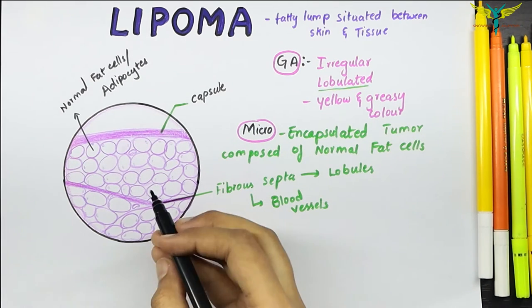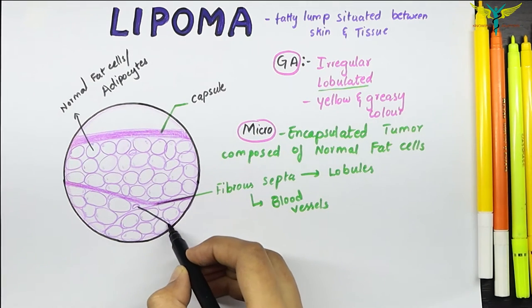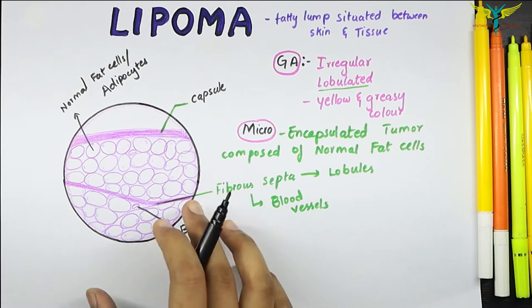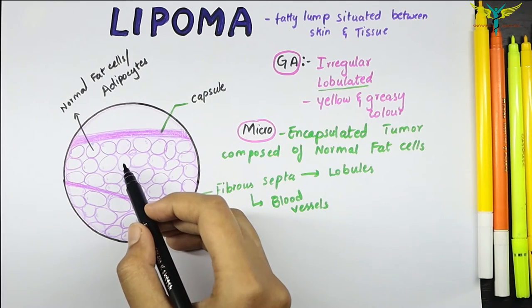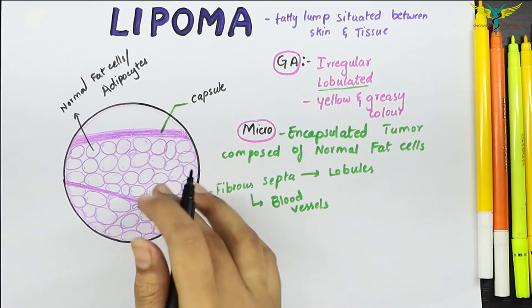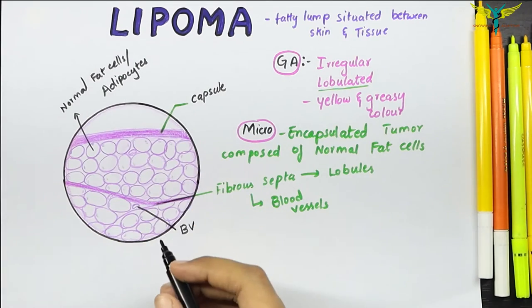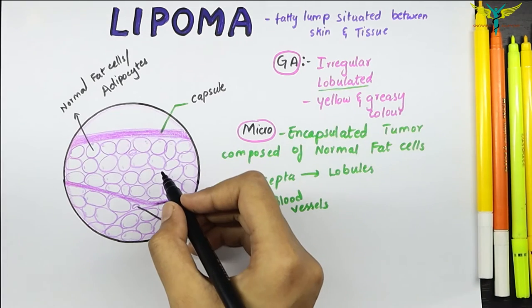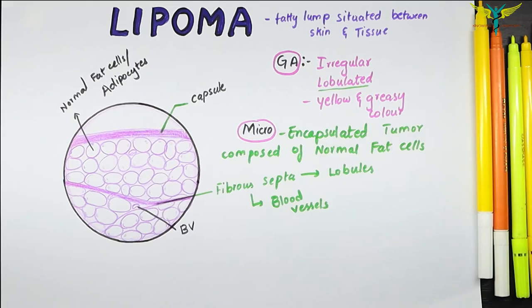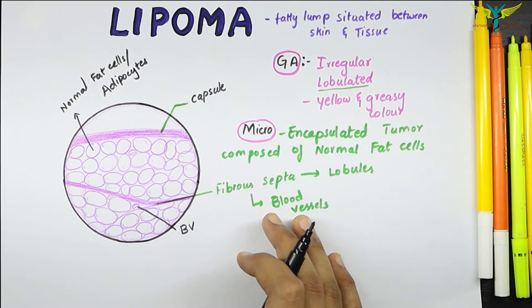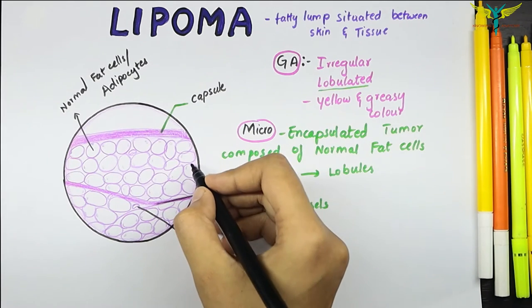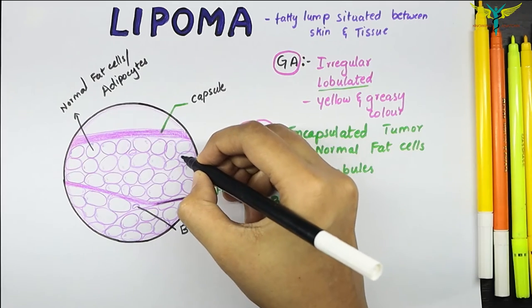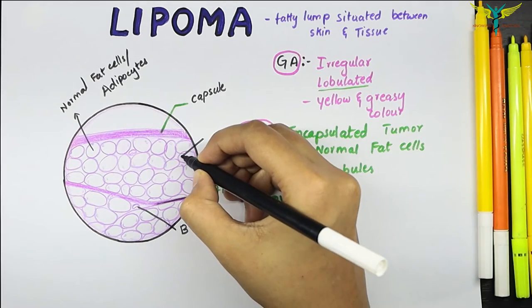You can note the blood vessels within the fibrous septa. The adipocytes themselves are small round cells with clear cytoplasm and peripherally pushed flat nuclei. Here you can see the flat nucleus pushed to the periphery of the cell.